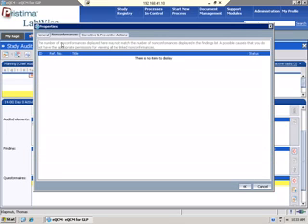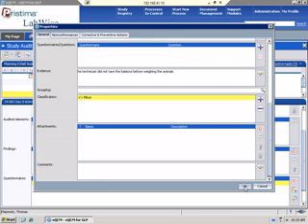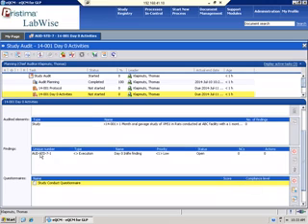Again, because it's a finding, as the finding goes through its life cycle, any nonconformances or CAPAs that are associated to the finding get linked on here as well. So right now we're just creating the findings. So when I click OK, we get an automatic numbering, which you can define the numbering schema. And so here's the finding associated with this audit task.